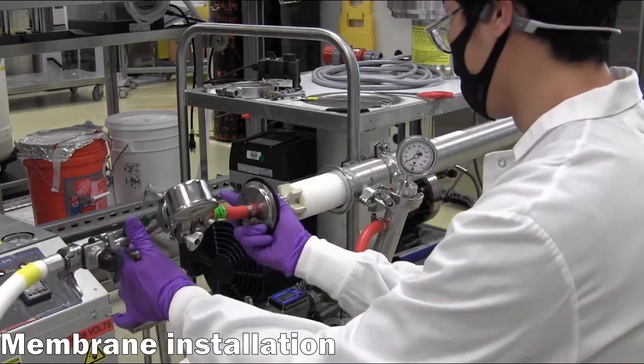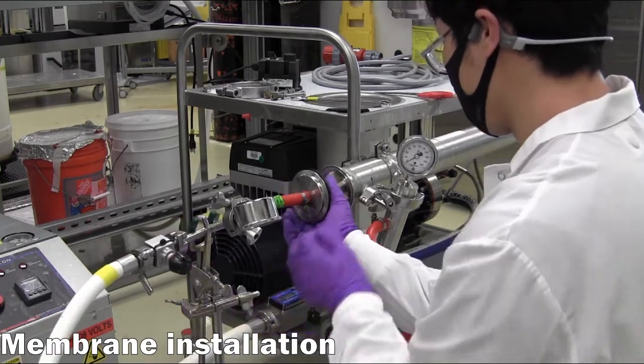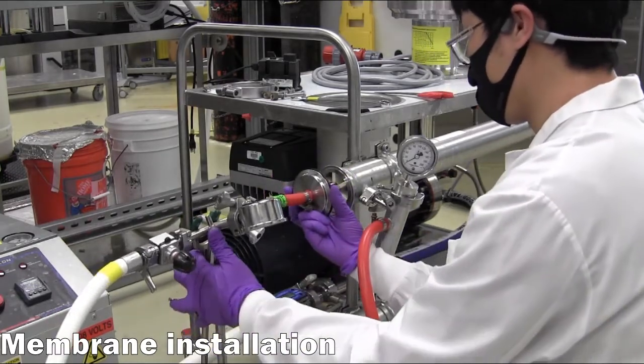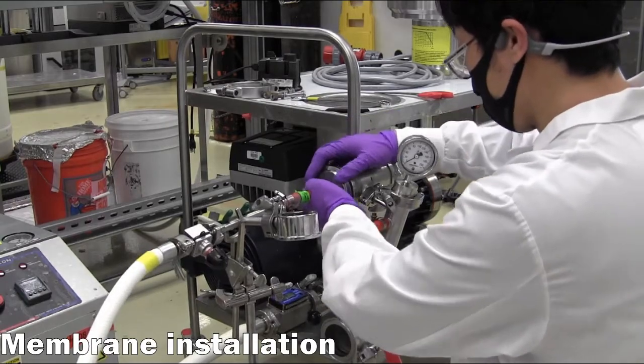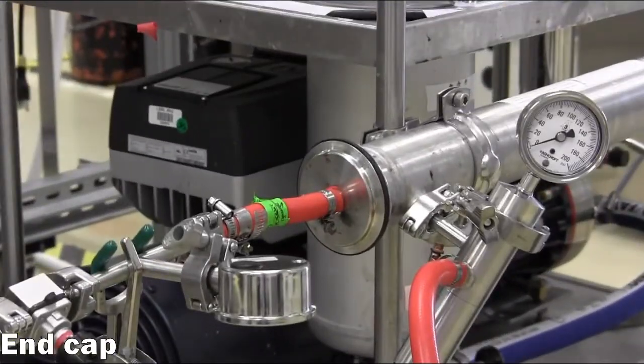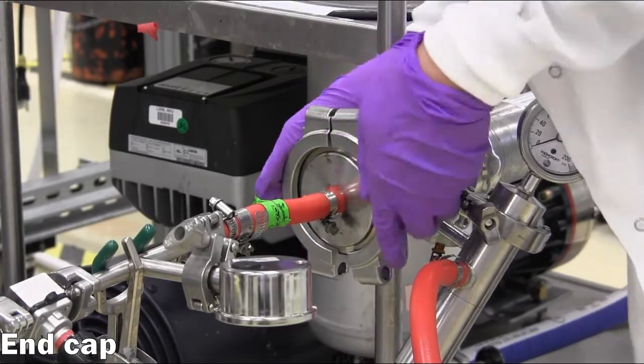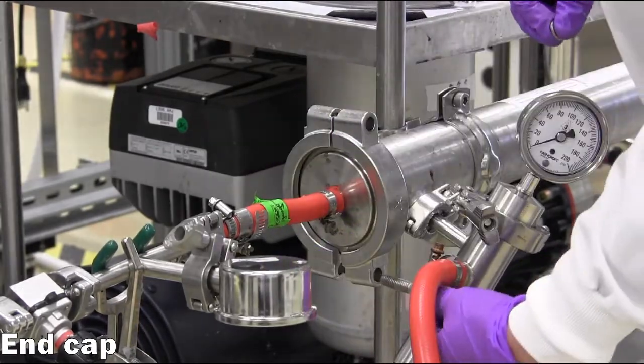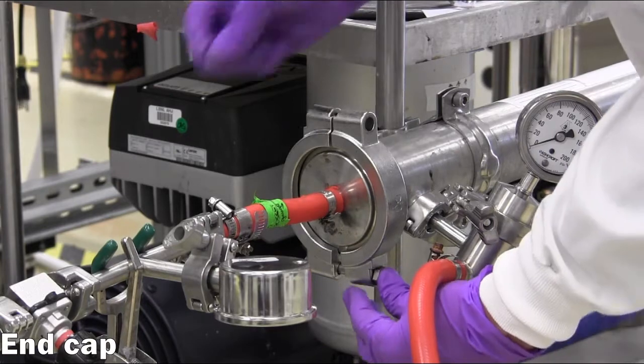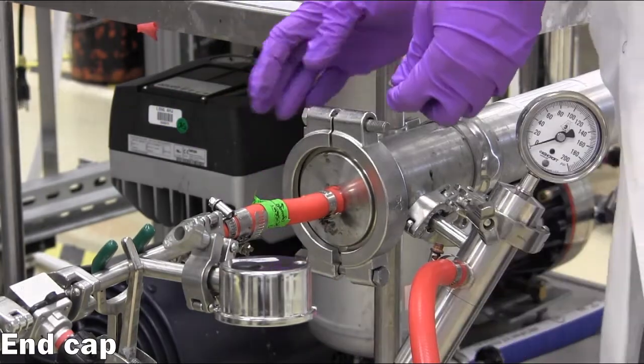Now the membrane is fully inserted into the housing, and the end cap is reinstalled. The end cap clamp is secured with fastening hardware, and then tightened with a wrench until the clamp is secure.